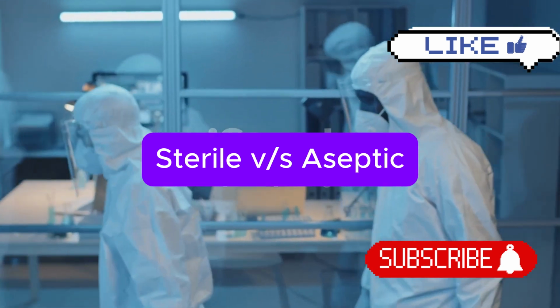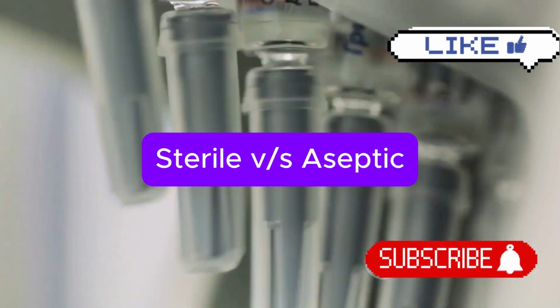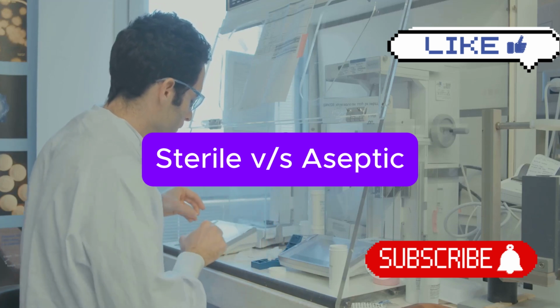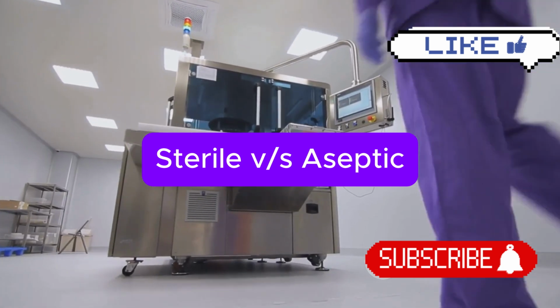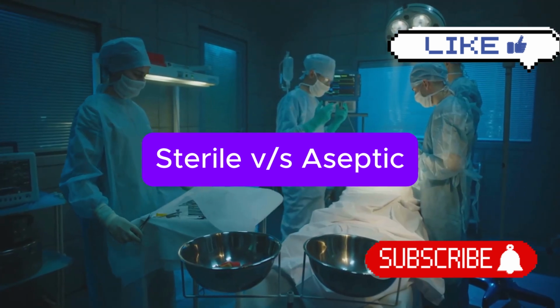The key difference between sterile and aseptic lies in their scope. Sterility is absolute, the complete absence of life. Asepsis, on the other hand, is about control, minimizing contamination to an acceptable level. You can have a sterile object within an aseptic environment, but you can't have an aseptic object within a sterile environment. Imagine a surgeon operating on a patient.